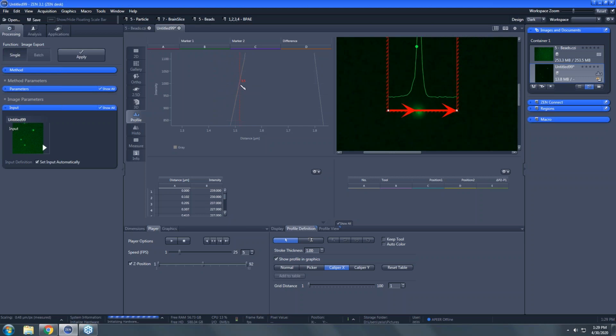So Nicole's going to go and find that intersection of the profile with the 1000 point. Uh-oh, we've taken our data off to the side. That's okay. If you click without seeing it, Nicole, and just finalize it and then zoom out, you'll be able to move it again. So you can adjust it. There we go. Yep. Click and drag, and we've got, terrific.